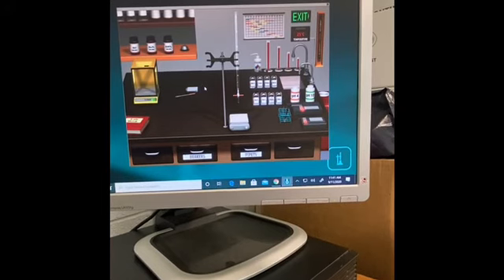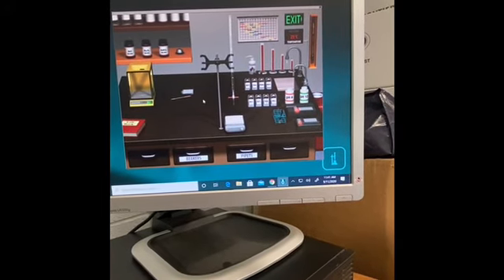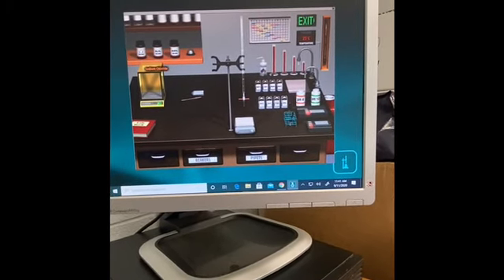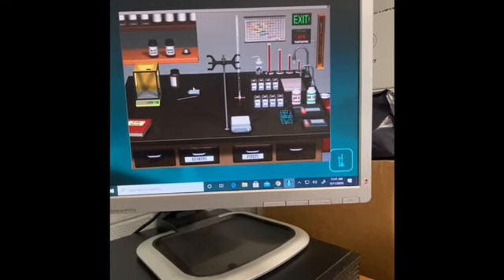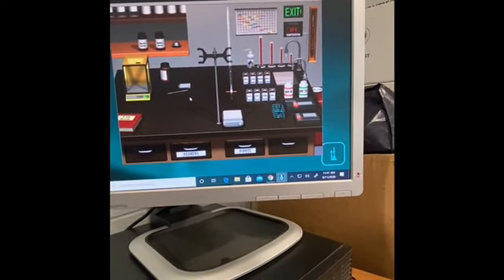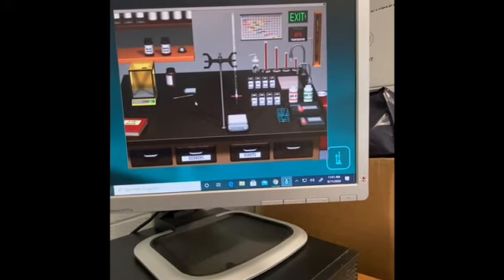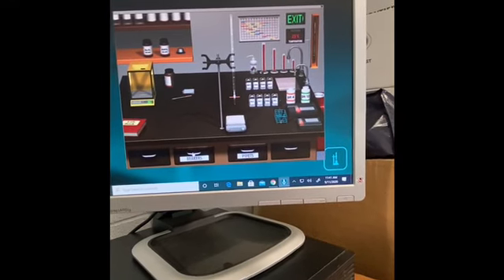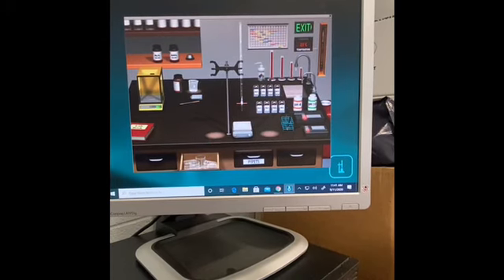Step number 3, for each salt that was selected in the stockroom, complete the following procedure. Double click or drag the bottle from the stockroom. So we're going to take up here the NaCl and drag it. See, sodium chloride. Now, click on the beaker drawer and place a beaker in the spotlight next to the salt bottle in the balance area. Well, there's the beaker, so right here, we're going to click a beaker and drag it over to the spotlight.